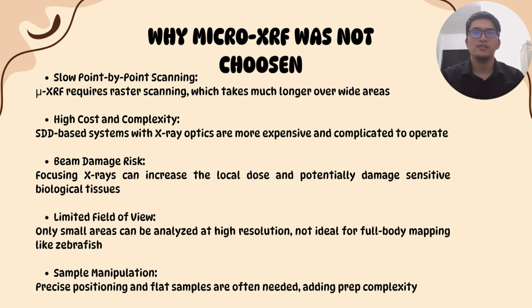Now we are going to discuss why micro X-ray fluorescence was not chosen and instead it is full-field X-ray fluorescence that was chosen for the case study. First, micro X-ray fluorescence has slow point-by-point scanning. It requires scanning which takes much longer over a wide area. Next, it has high cost and complexity. SDD-based systems with X-ray optics are more expensive and complicated to operate.